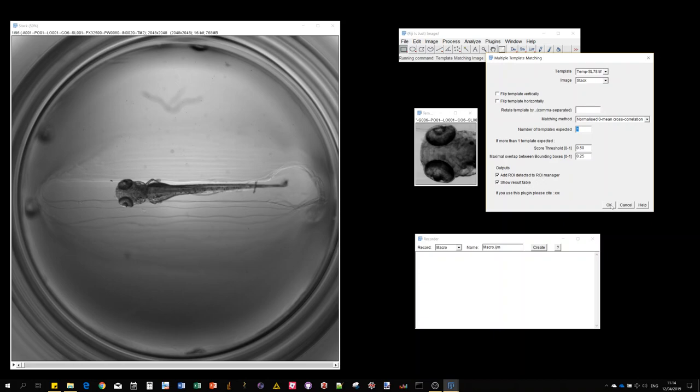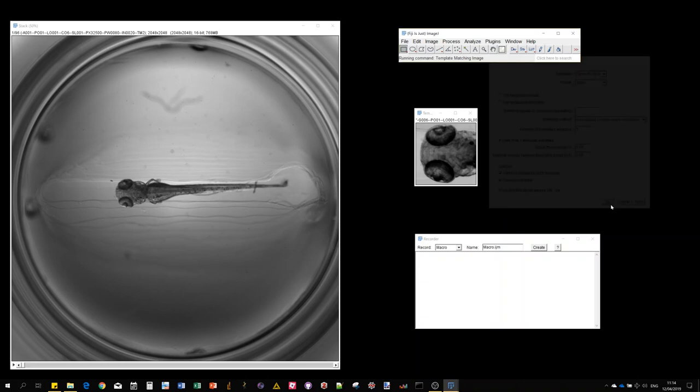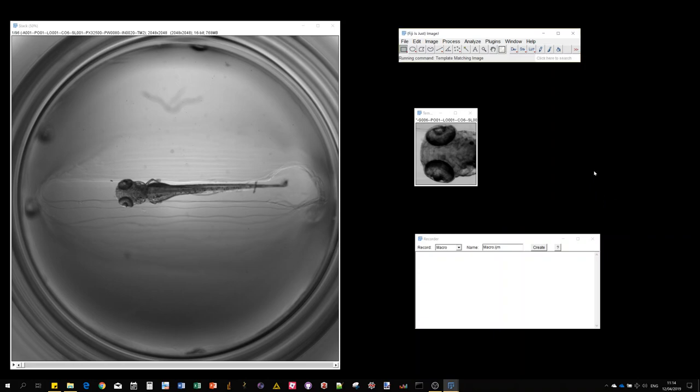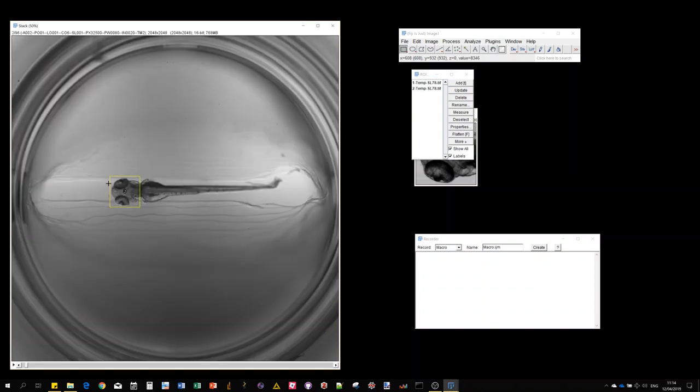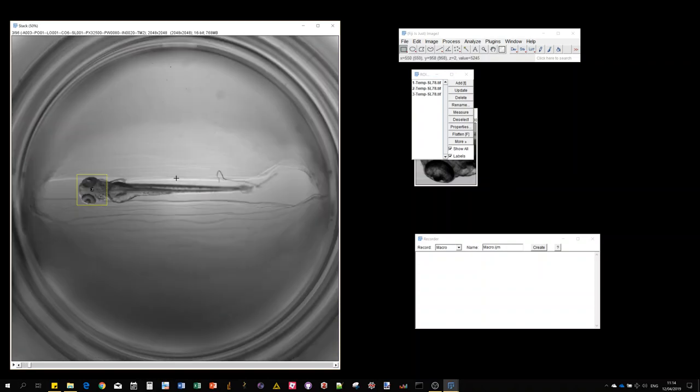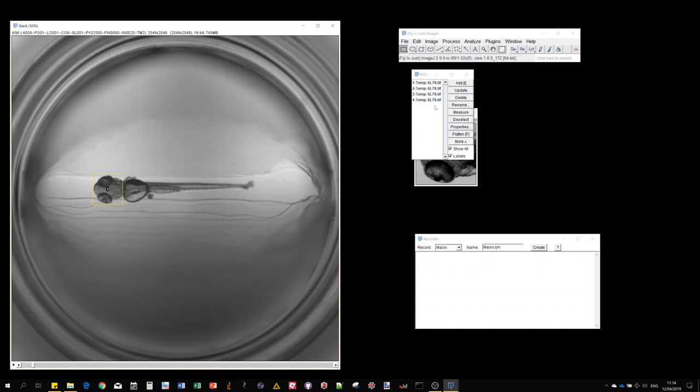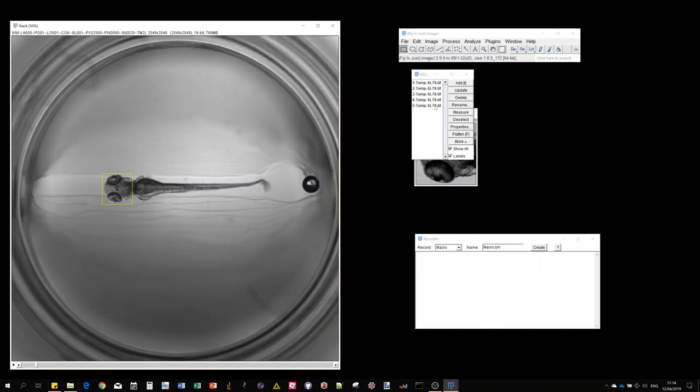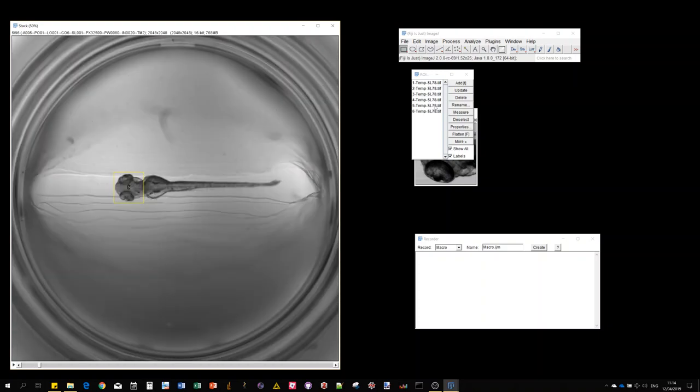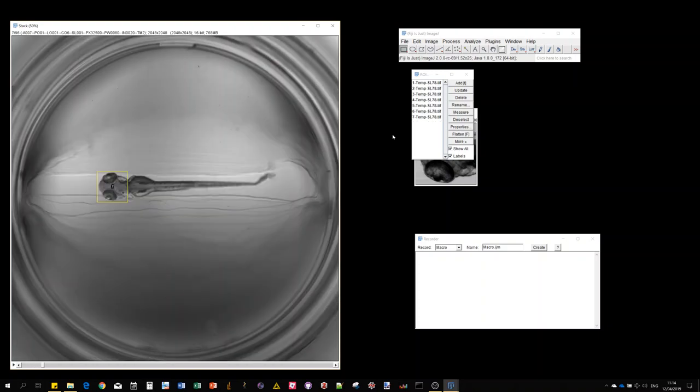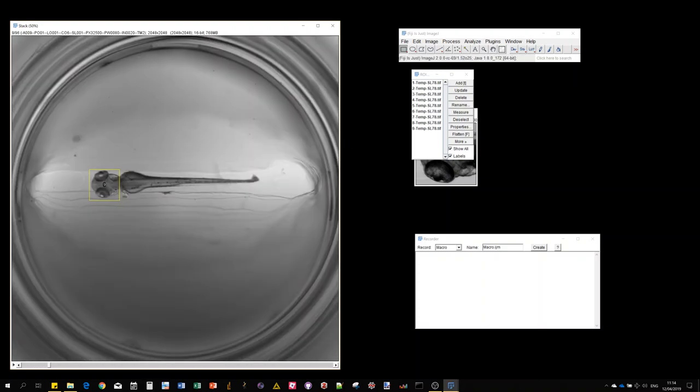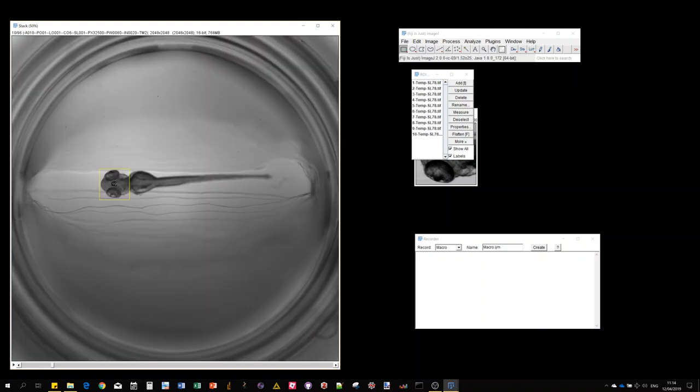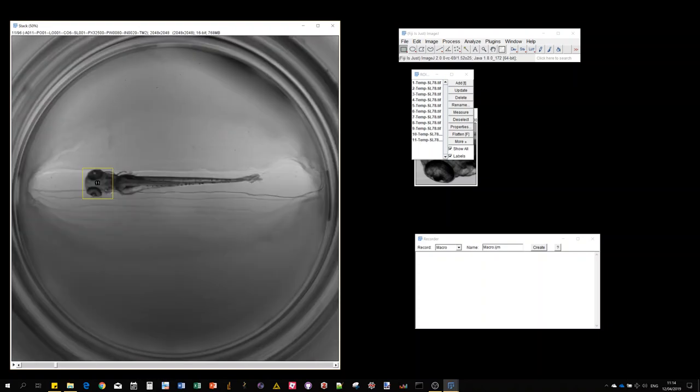Let's run it. The algorithm is going to automatically go to the next slice every time and the detected regions are appended to the ROI manager. At the end we'll get the result table and the recorded command will appear.